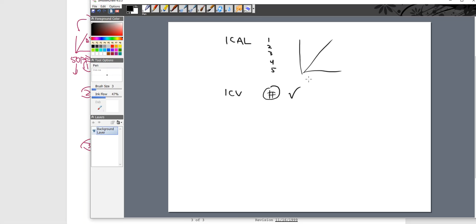Good news for you. Next up, it says in the table, then you're going to do a continuing calibration verification, a CCV. You're going to make it. You're going to run it. And just as before, you get a number. There we go. As before, 10% plus or minus. And let's say, cha-ching! I get it! Woohoo! Okay. All right. I see.